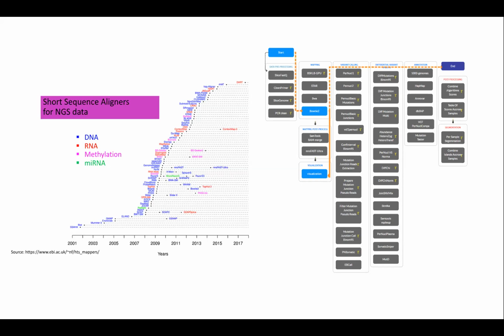And we'll talk a little bit about the different types of sequencing, also some of the ones that you are mentioning in the chat, PacBio, Oxford Nanopore, so different types of sequencing that are not traditional next-generation sequencing like Illumina does. But we will talk about these different sequencing techniques in the context of how does that impact our ability to align them to the reference genome and then visualize the results.